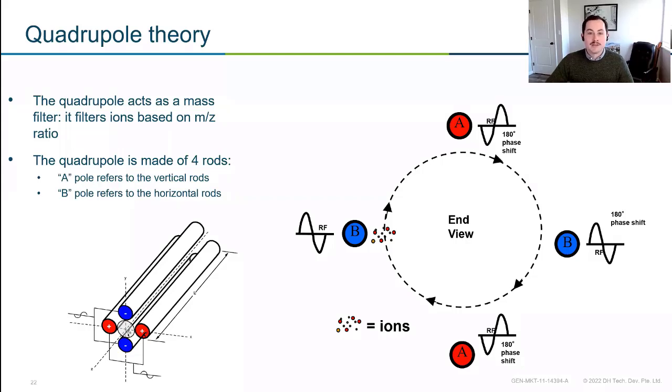So what the software and mass spec is essentially doing is applying voltages to do that. You filter out those other ions that you're not interested in and really only retain that one mass that you care about.